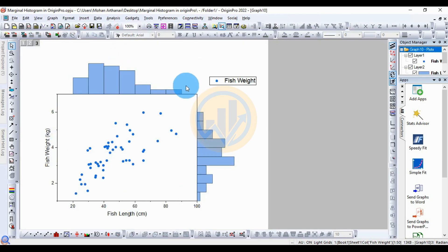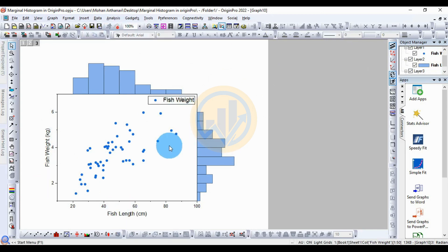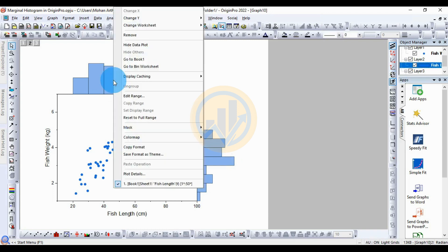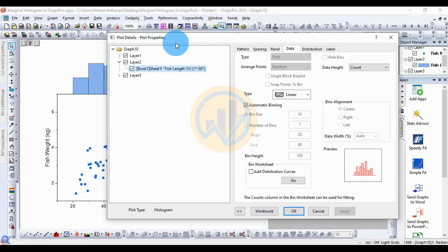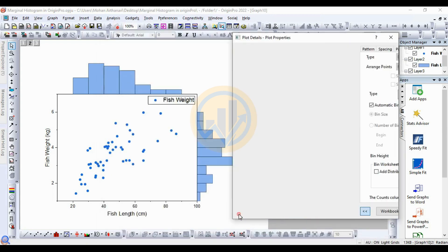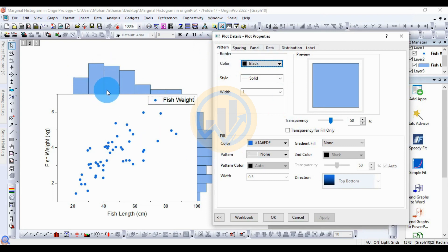Now, how to customize the marginal histogram graph in OriginPro. Double-click or right-click on the histogram to open Plot Details. A new tab for Plot Details and Plot Properties will open. The first main option is the Pattern menu, which controls the color and border of the histogram for both fish length and fish weight.